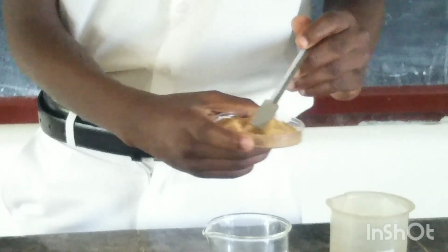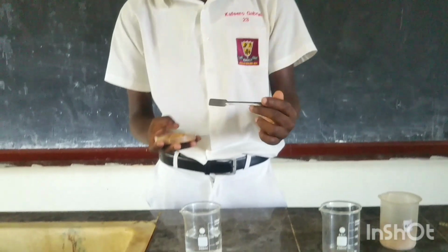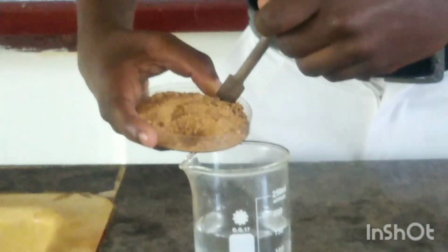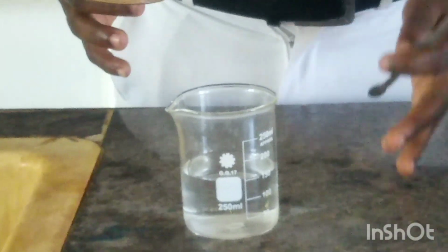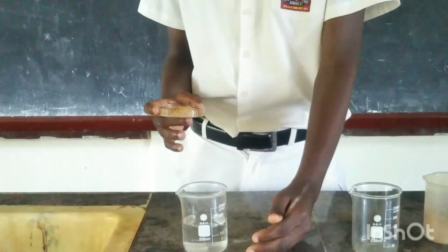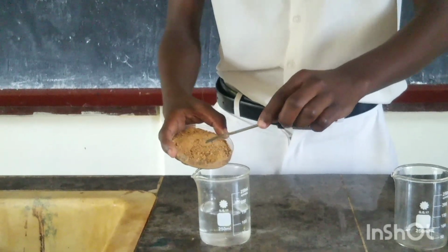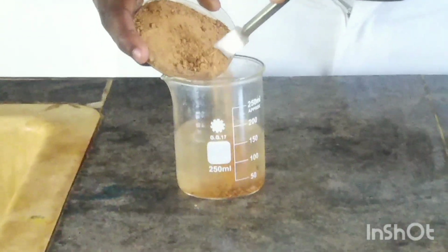After removing the big particles, the next step is to pour this sand into my beaker. As I pour, I have to pour carefully and make sure my working surface is clean, by not spilling the sand onto it, so that we can get a clear and good practical. So here I pour my sand into the beaker containing water for our experiment.